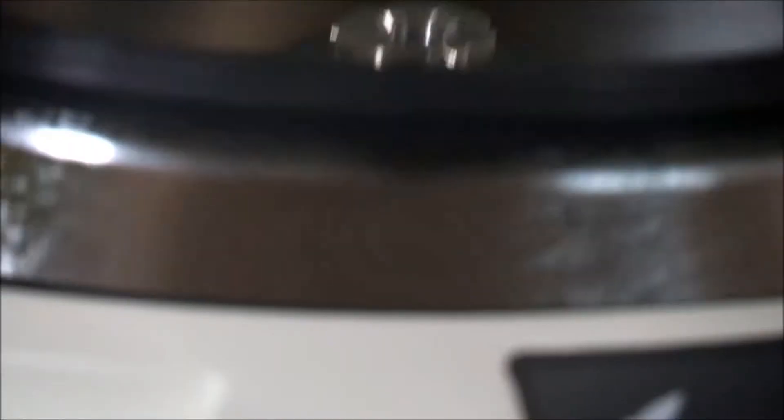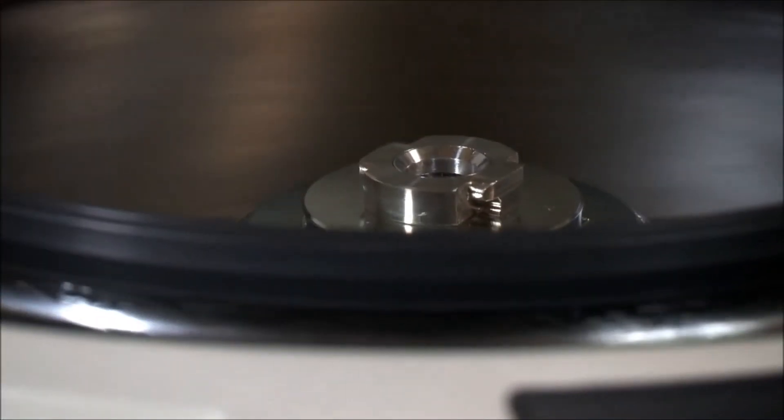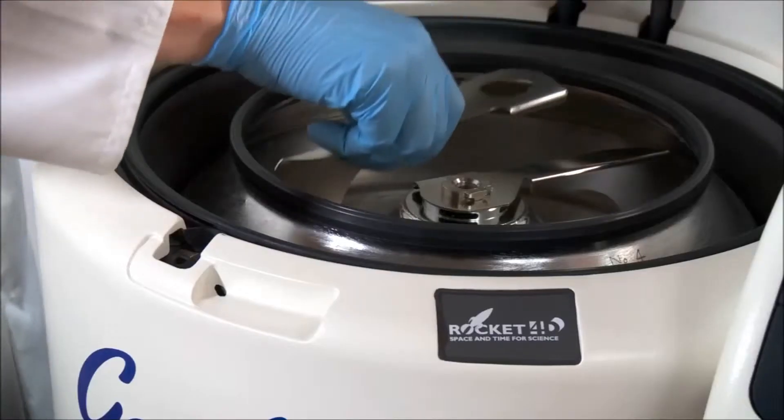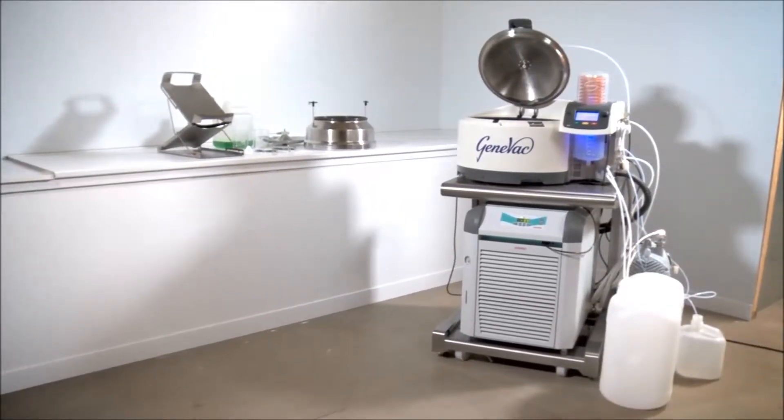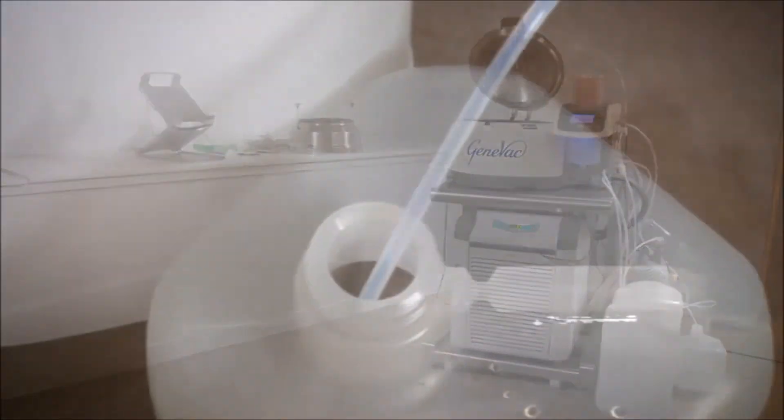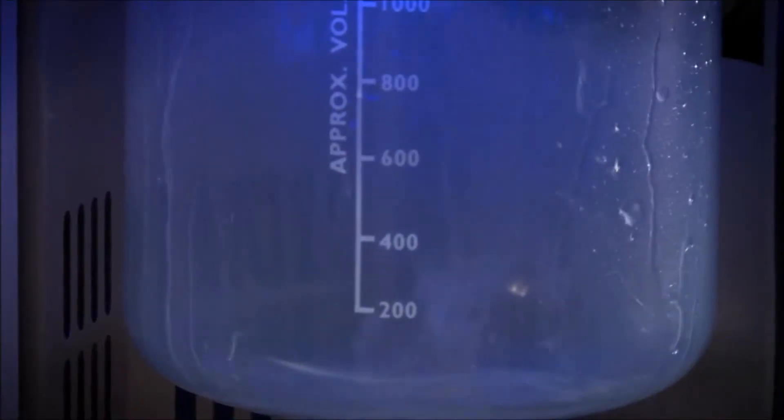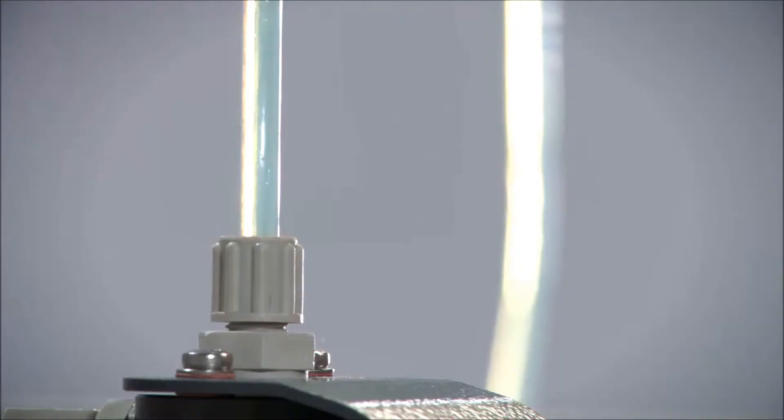The bowl rotor evaporation vessel can work with up to a 5-liter single volume and can be used in the Rocket Synergy for small batch processing. When fitted to the Rocket 4D Synergy with auto-feed capability, the process volume can be up to 100 liters.